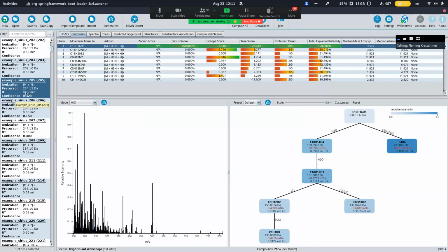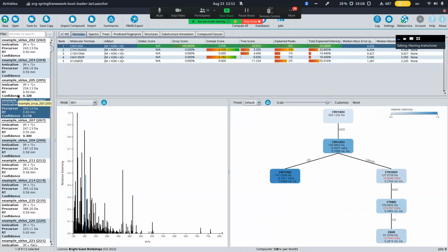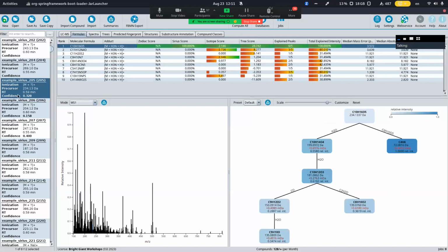Oh yeah, maybe it's a good idea to ask if everybody has something. So I hope everybody could run some computations. And if you run computations, for example, on 5 compounds or so, maybe a few of these compounds now have an additional entry for confidence score. Yes? I think we may be crashing the server as well. Oh. We got disconnected. Ah, okay. Sorry? Are you logged into the workshop account or to your own account? Ah, okay, maybe it would be a good idea to switch, because there are actually different servers for the workshop accounts, which might be faster. Yeah, exactly.